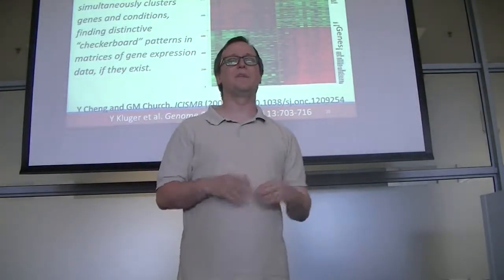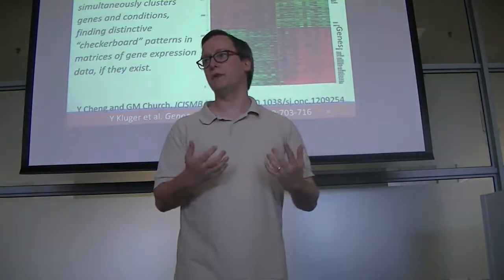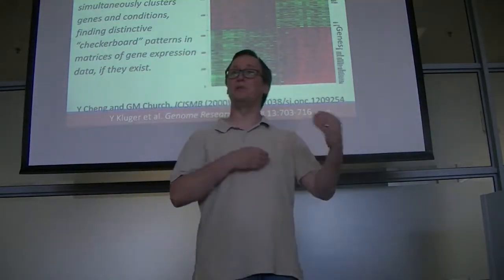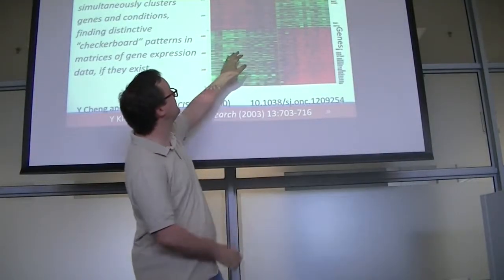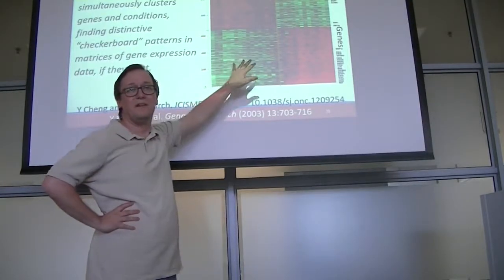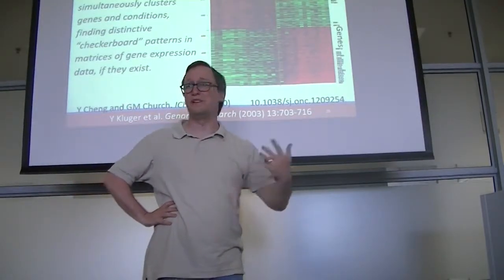Now, if you're a male in this room, you may see very little distinction between the red and the greens. If so, color blindness is difficult for red-green plots. We really could have chosen a better combination of colors than red and green for these plots. Correspondingly, you will see people doing blue versus yellow plots for these. Those options are good ones for you. So, if you're not colorblind, hopefully you're seeing red here, red there, green up top, and green over here. Grand. So, is anyone not seeing differences in those colors? I'm just curious. I've been fortunate that I have color vision, but I know not everyone does.